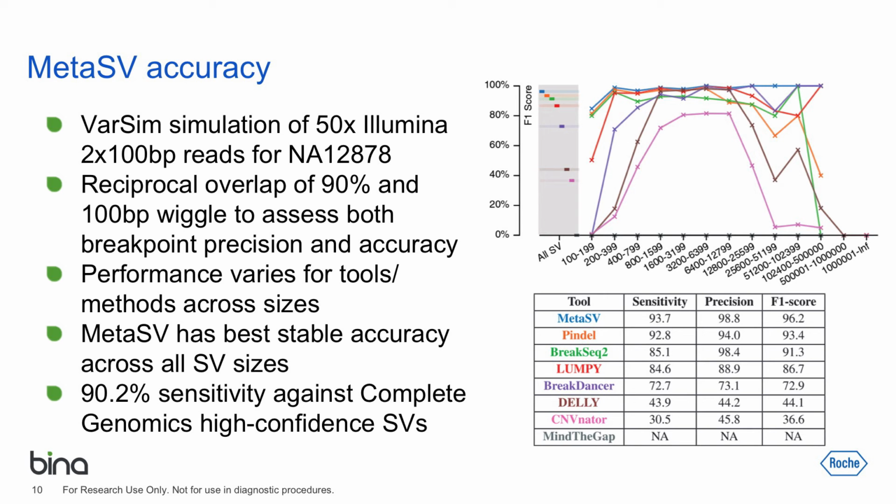In conclusion, MetaSV was able to improve the accuracy for SV calling by integrating across different tools and methods in a smart way, and as a result achieves the most stable and the best accuracy for calling SVs.